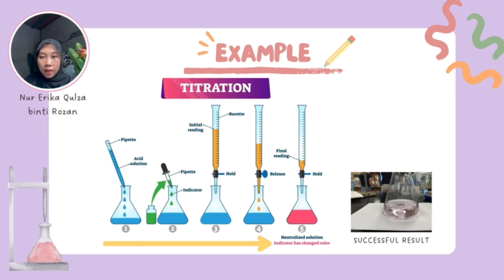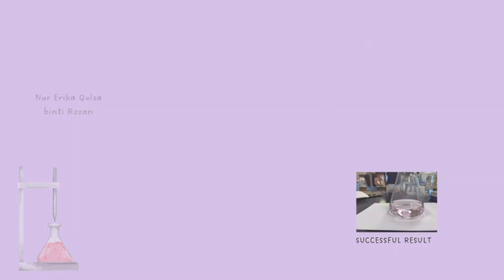As soon as the indicator shows a sustained color change indicating that the acid has been neutralized, we stop adding the base. The color of the solution should be pale pink, indicating that the titration is successful. We record the final reading of the burette. The volume of base solution used is determined by subtracting the initial reading from the final reading.